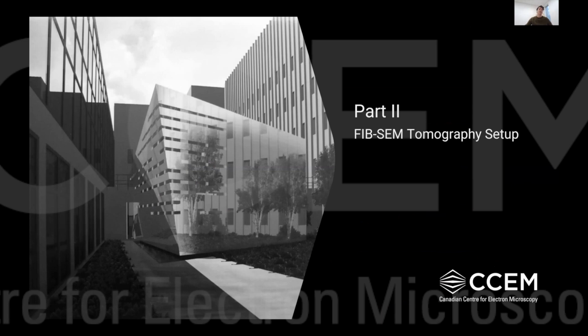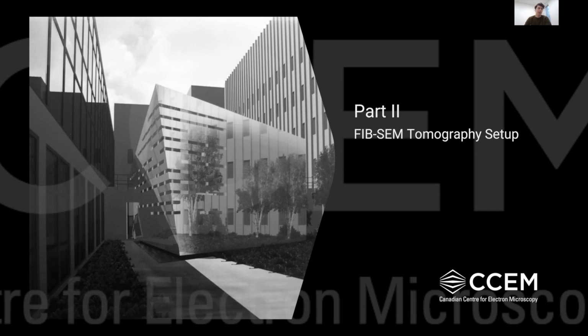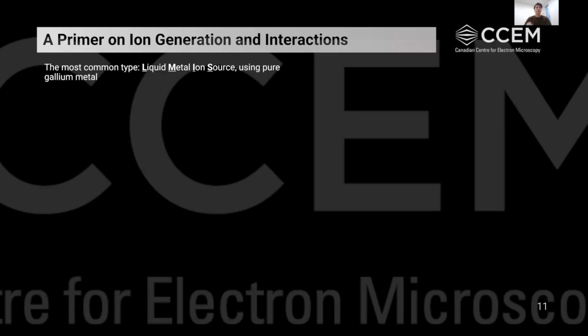So now that we have a good understanding of what FIBSEM is able to do, I want to jump into the microscope for a minute to look at how we actually set up a FIBSEM tomography run and what's going on inside the chamber. And to do that, perhaps it's best I give a quick primer on ion generation and interactions.